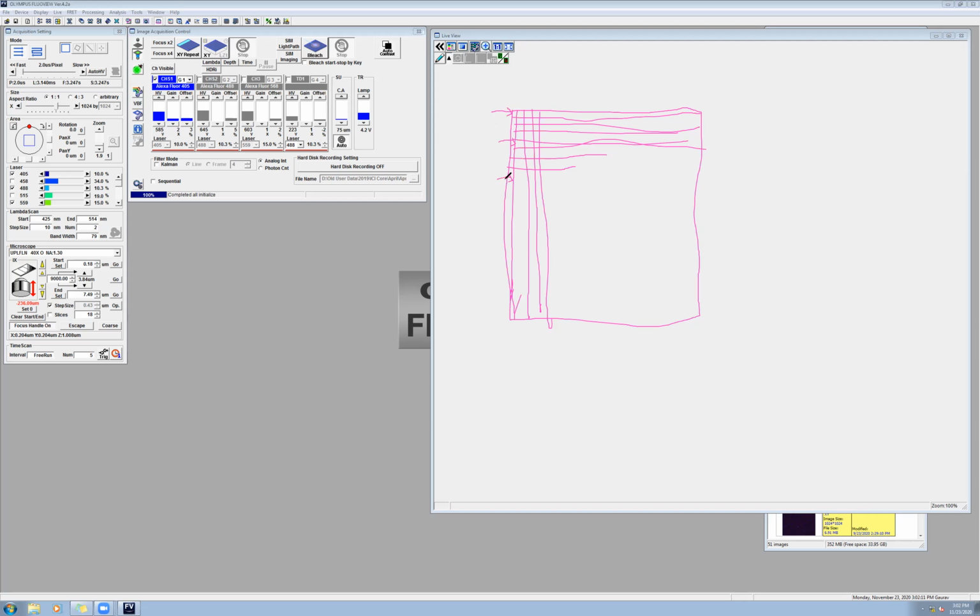So focus times 4 means it images the fourth pixel area in the vertical direction, which means it's going to scan things very fast, but that would also mean that everything will be very pixelated. Make sense? Focus times 2 means it's going to scan every other. So it's going to scan this one, skip 2, and scan this.